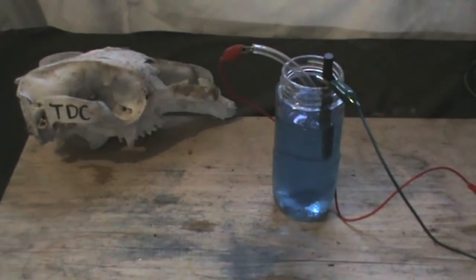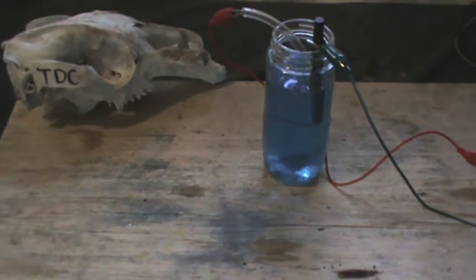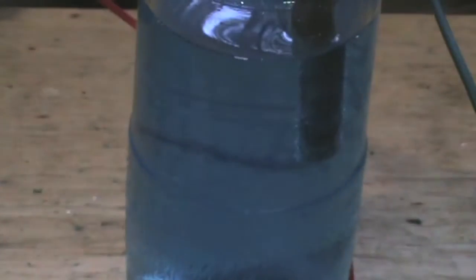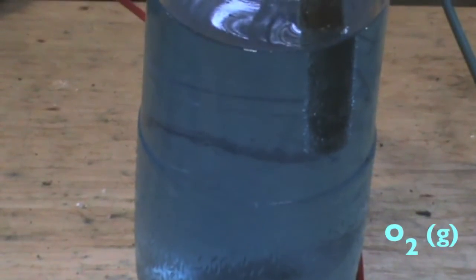After all the necessary connections are made, turn the power supply unit on. As we can see, bubbles are liberating off from the lead dioxide anode. This is oxygen gas.